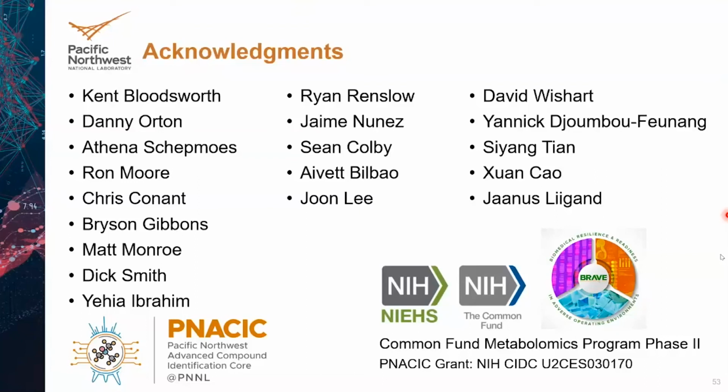There have been some nice papers on freeze-thaw cycles in particular that look at metabolite stability. I would argue that we really can't fully address these phenomena or the impact of these phenomena until we can identify the majority of our data. Because when you're looking at, I don't know, less than 10% of the data set as confident identifications and the rest are unknown features, it's difficult to say the degree of impact that any type of manipulation or perturbation of the sample might have on the chemical composition.